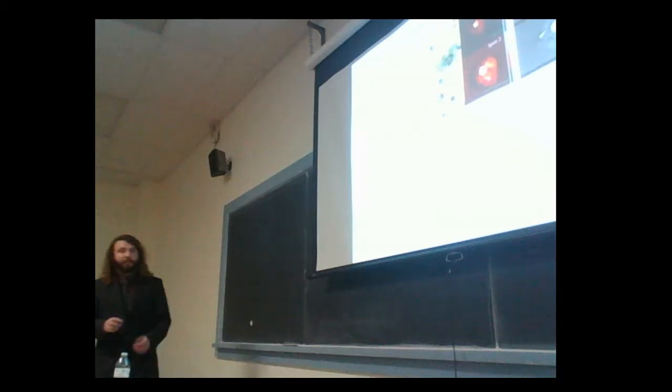This is very important if you're trying to make any devices with this material and you need to cure it for something. Another thing we did is I switched Raman lasers and used the red laser, and I performed measurements on copper-doped titanium diselenide with various copper dopings from room temperature down to roughly 88 Kelvin. This allowed me to fill out a large portion of the phase diagram. What you're seeing here is increased copper doping, where this right here is the one just beyond the point where you induce superconductivity at lower temperatures, and this is even further beyond that.